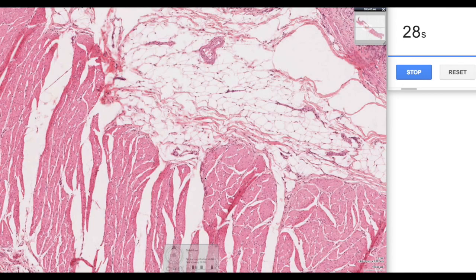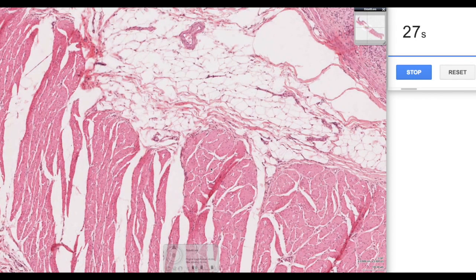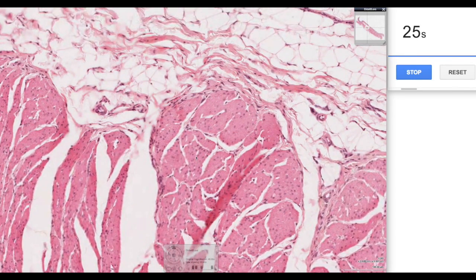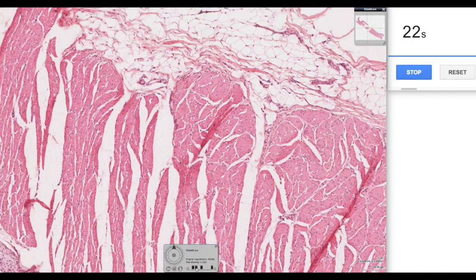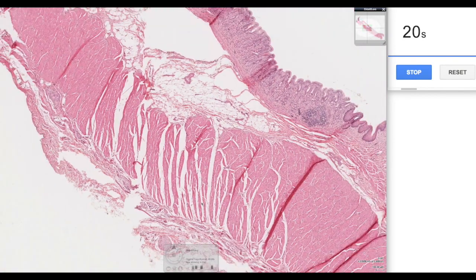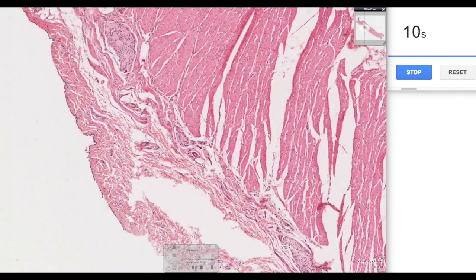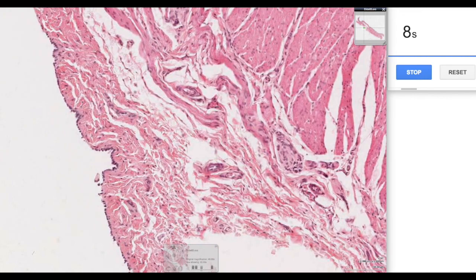Then we have the muscularis layer — you can see again that's smooth muscle. In the stomach we actually have three layers; we have a new oblique layer which is unique to the stomach in comparison to the rest of the gastrointestinal tract. And then on the outside we have a serosa — you can see this line of mesothelial cells with an underlying layer of connective tissue.